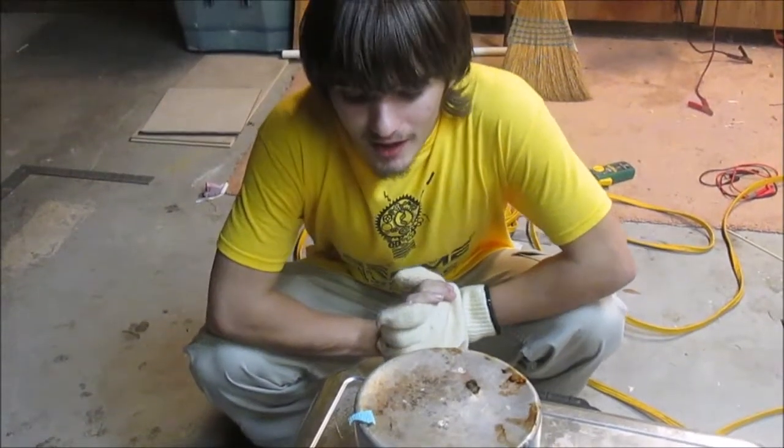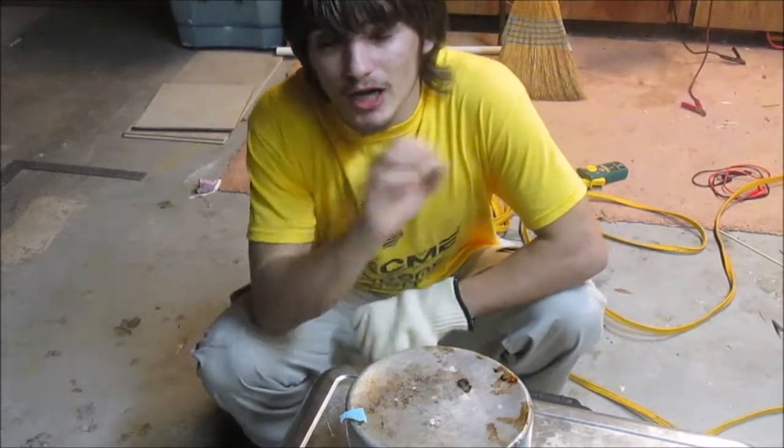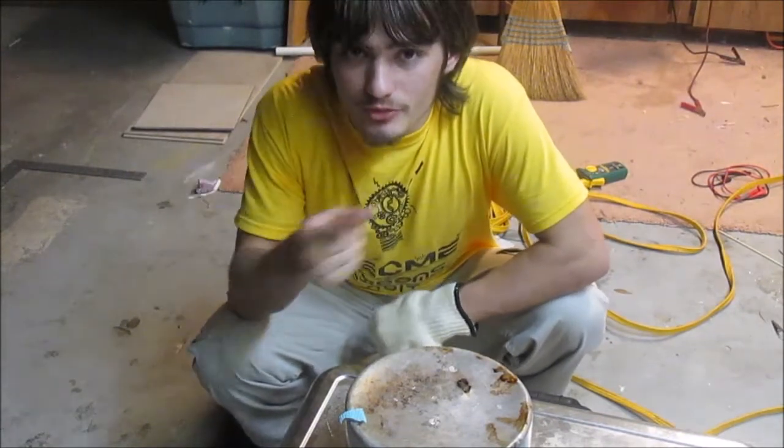Hey, welcome back to Dunbrae. A little while ago, we made some copper nitrate by reacting copper — pure metal — with nitric acid.